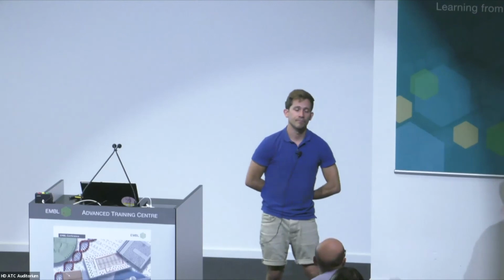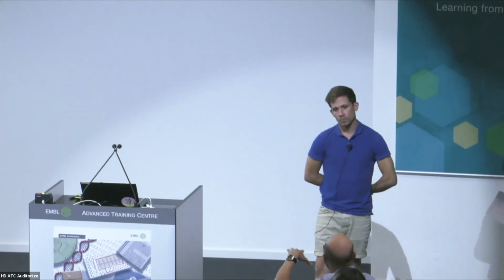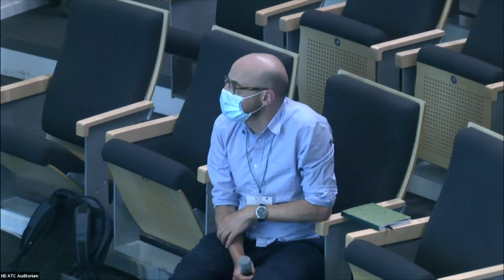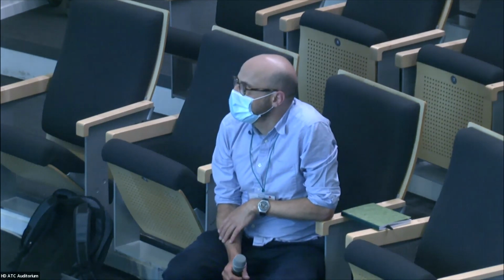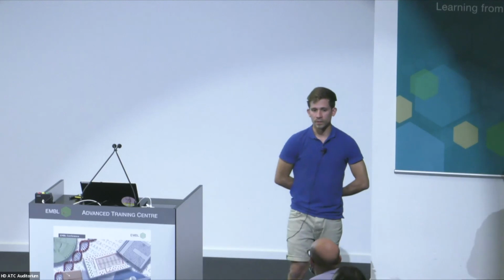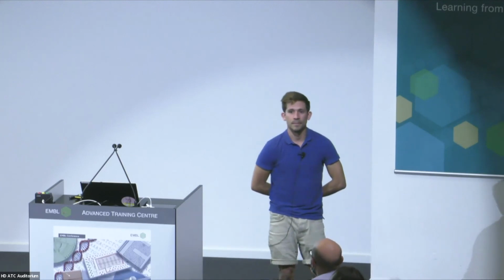Okay. Thank you. So I have a question. Maybe you said it, but I didn't catch it. Why is it that you have three-dimensional structures in the microchannel and not in the transfer device? Yeah, I think it's all to do with flow because we did cultures on the chip without flow, just static cultures, and we also obtained a flat monolayer. With flow, which adds the shear stress, I think that gives enough stimulus to the cells to form these kind of three dimensions. So it's not a mechanical stretching. We don't include any mechanical stretching like they do in the Emulate devices.